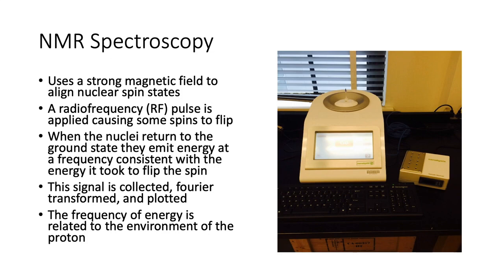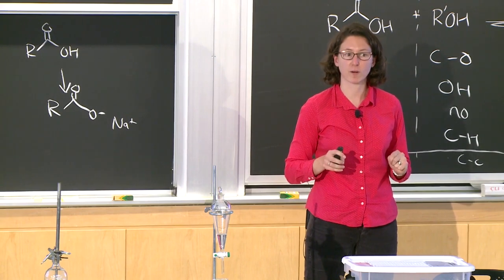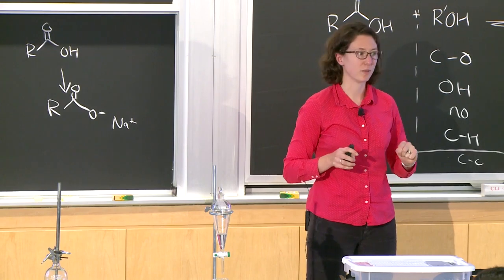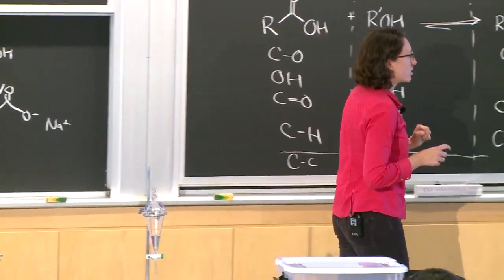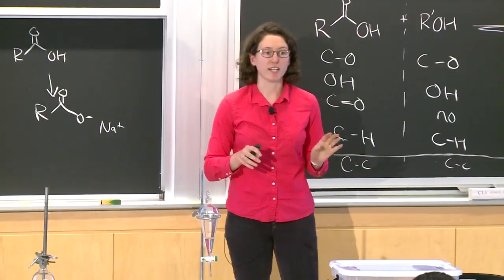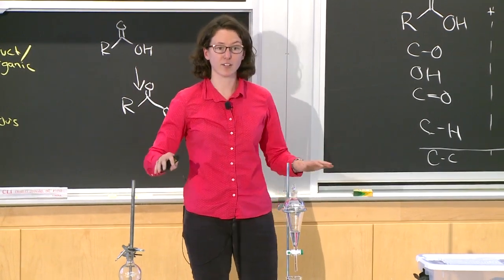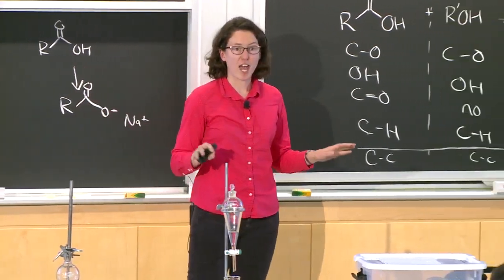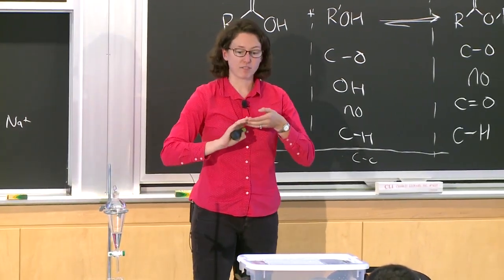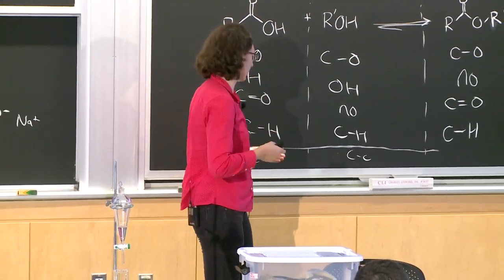The second to last technique we're going to use is NMR spectroscopy. And how many of you guys have seen NMR before in your classes? A few people. All right. So in, I think, about 2 weeks, Walt Mashevsky, who is the director of the NMR facility here in the chemistry department, is going to come and do a very, very thorough lecture on NMR and how it works and how to interpret it. Unfortunately, that lecture will happen after some of you guys take these spectra in the actual lab.